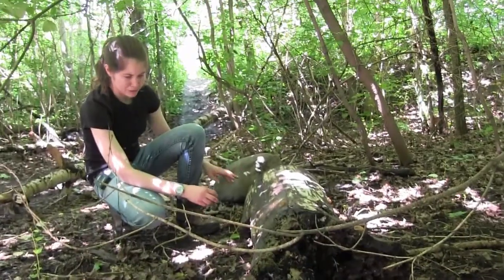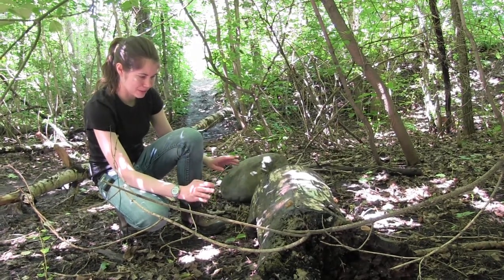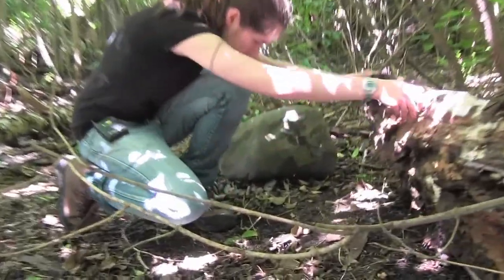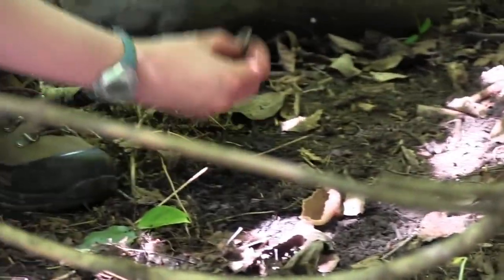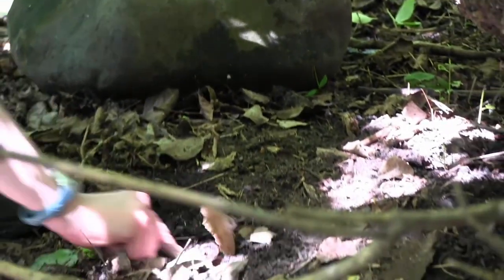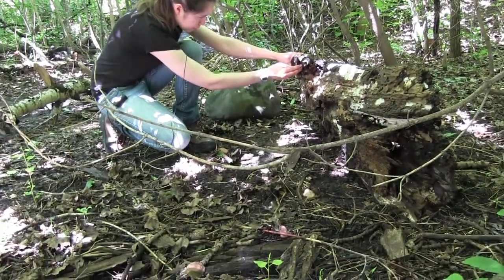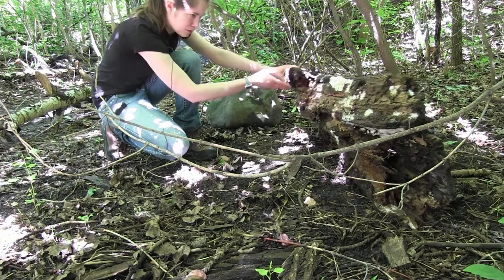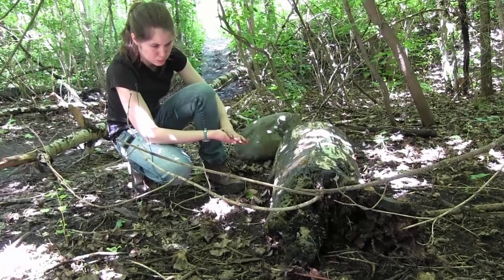When you flip a log, you need to be quite ready to look for earthworms that second, because they do move away fairly quickly. So here I got one. Sometimes there's also worms in the soil attached to the log, because some earthworms like to feed on decaying wood as well.